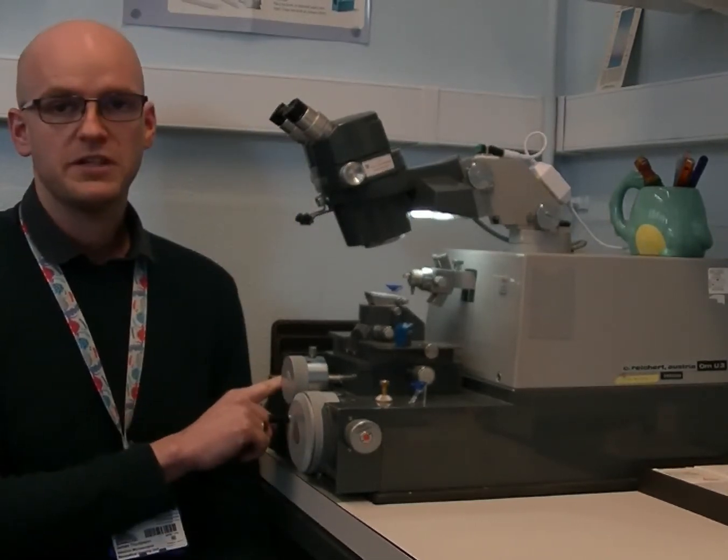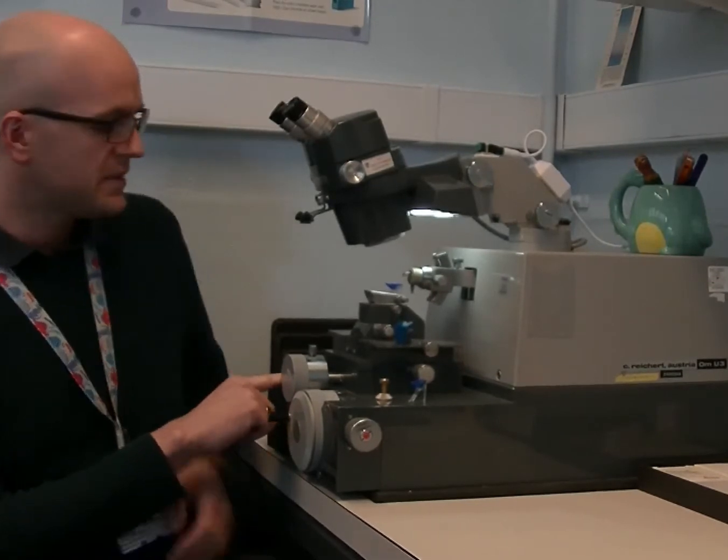The next stage we want to be able to look at what our tissue contains under the microscope, so we would use an ultra microtome to take thin sections of our tissue to be able to stain them.